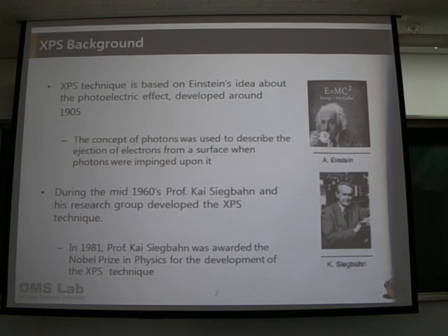XPS technique is based on Einstein's idea about the photoelectric effect developed around 1905. The concept of the photon was used to describe the ejection of electrons from the surface when photons impinge upon it.